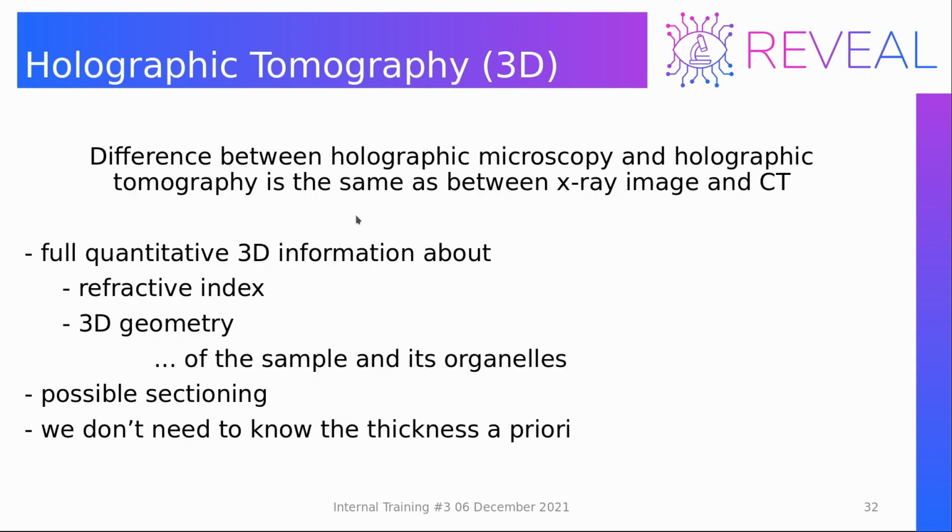The difference between the holographic microscopy that I have just described and holographic tomography is the same as between X-ray imaging and CT scan. The X-ray image is like integrated information.